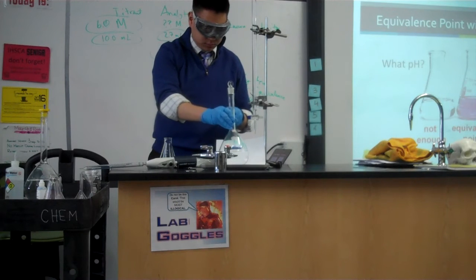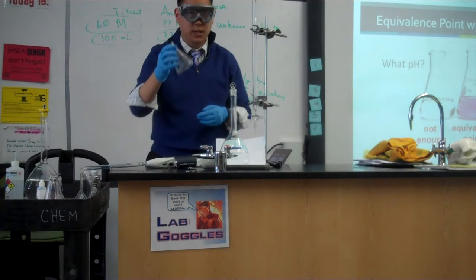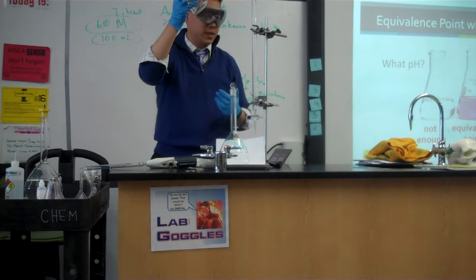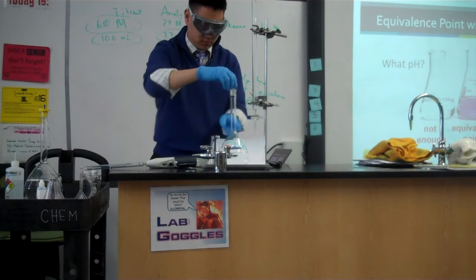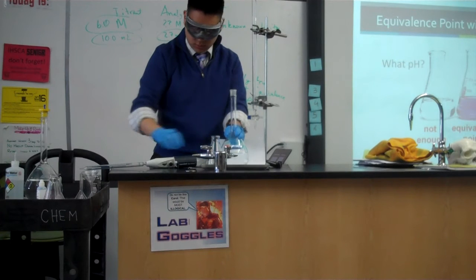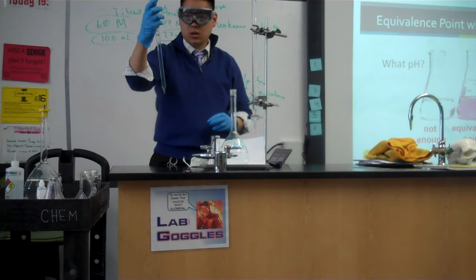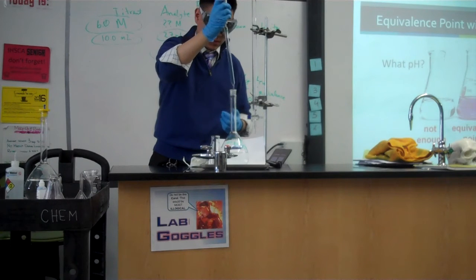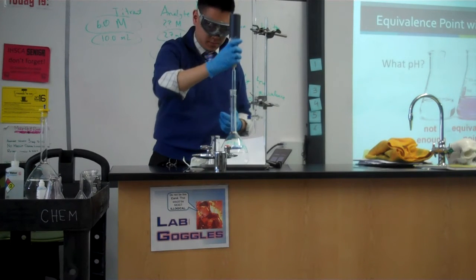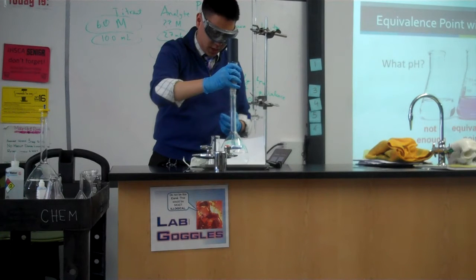Now, we need to obtain a certain amount of our analyte. For today's purposes, we're going to use 25 milliliters of the analyte. Can you put more if you'd like, or? You can, it's just going to change your calculations. That's fine. So, I'm going to put this inside. I'm going to extract 25 milliliters. Oh, that's so cool.